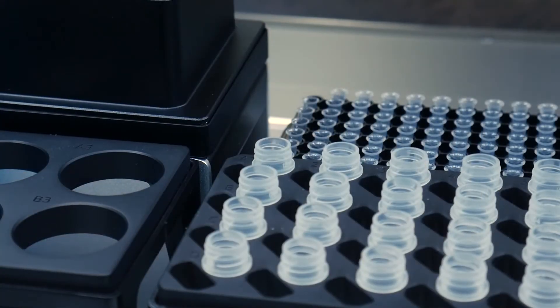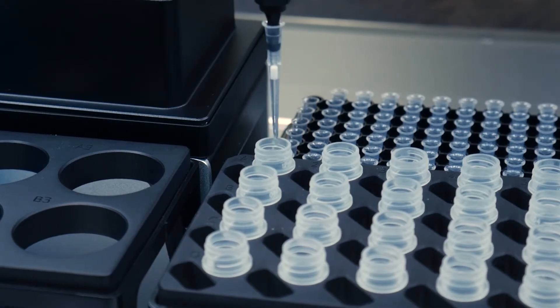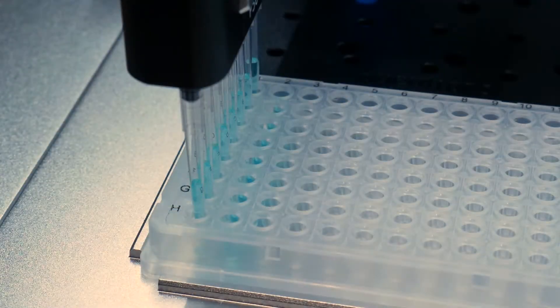Let me cover a few of the special features that the OT-2 has for maximum flexibility. Just like you do by hand, the OT-2 can touch the tip to get excess liquid off the pipette. It can also handle air gaps to lock liquid in the tip and prevent dripping. It can do blowouts, pushing extra air through the tip to ensure it's entirely empty. It can also do pipette mixing, aspirating and dispensing in sequence to fully homogenize the well contents.